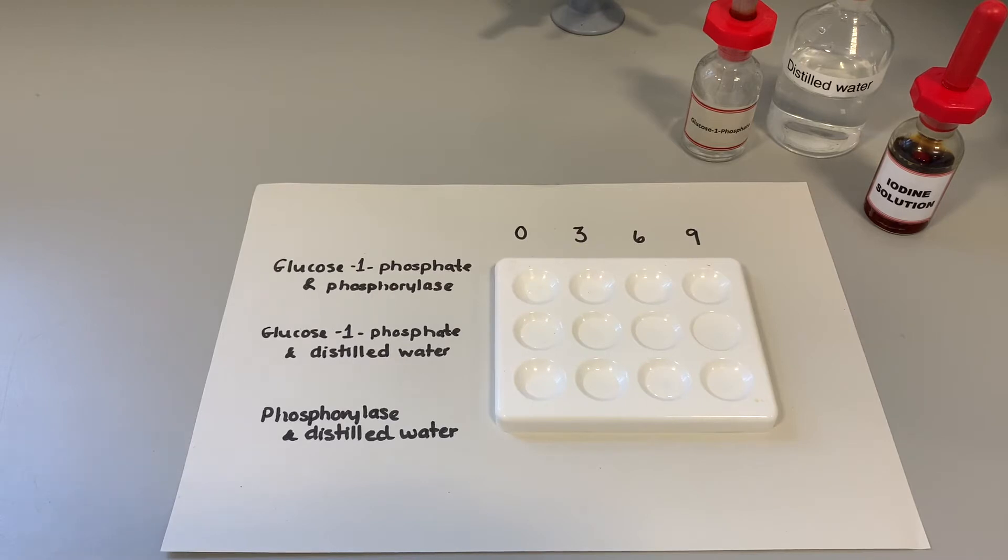We're going to put that in and then at zero minutes, three minutes, six minutes and nine minutes we are going to add iodine solution to see if starch has yet formed. Because remember enzyme controlled reactions do take time to happen.